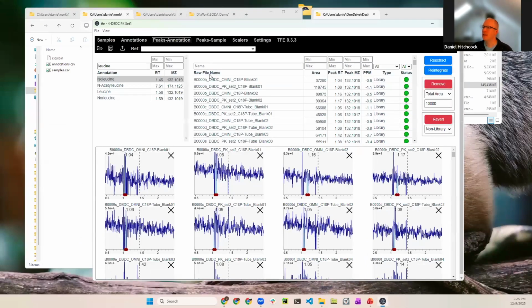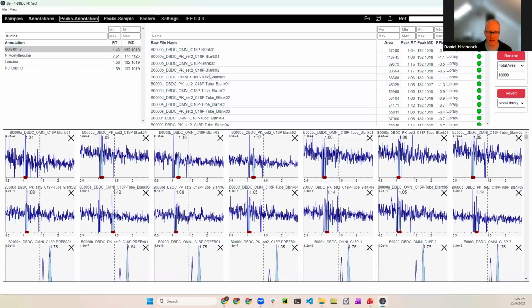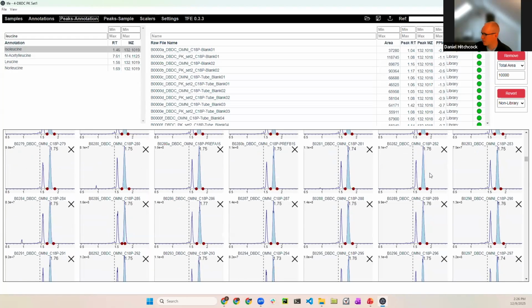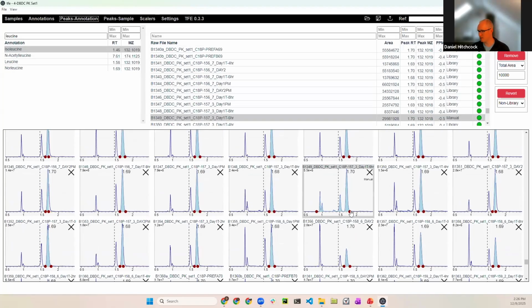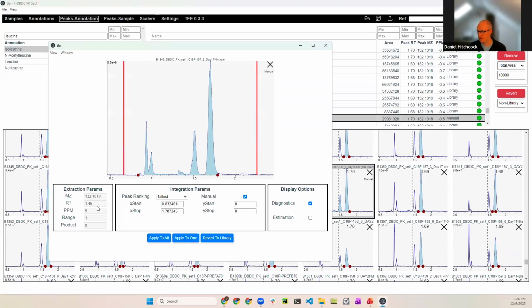Here is 2,000 files from 3 different studies on looking at dietary biomarkers in plasma, or finding those from people fed controlled diets. So this is isoleucine. I already pulled it up because time is limited, but here's me scrolling through 2,000 things that are viewed. I can adjust one if I wanted. Slightly laggy, but totally usable. I can click on it and make adjustments, explore.